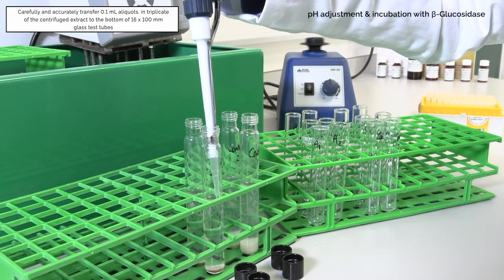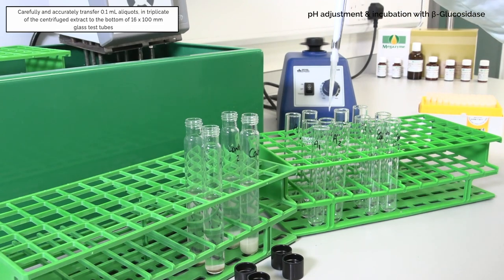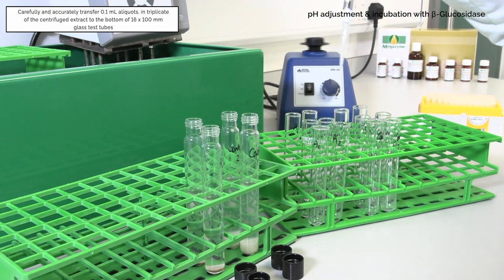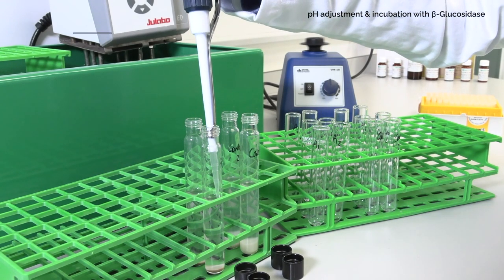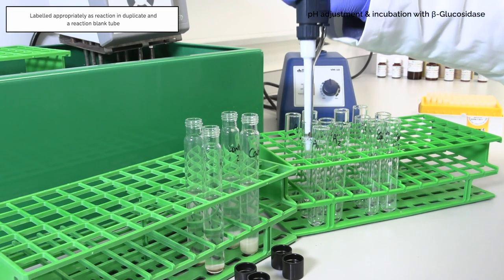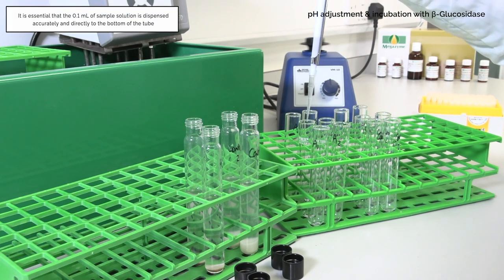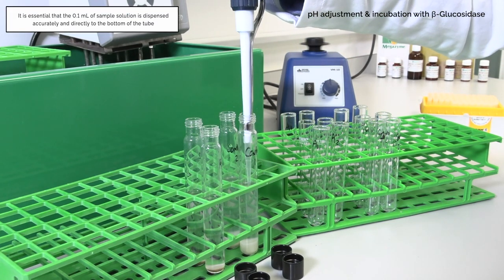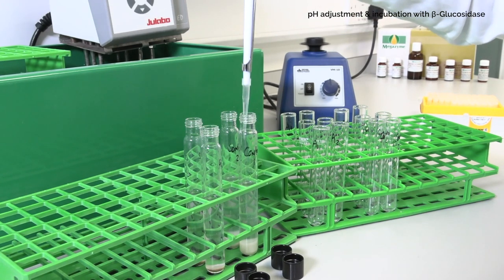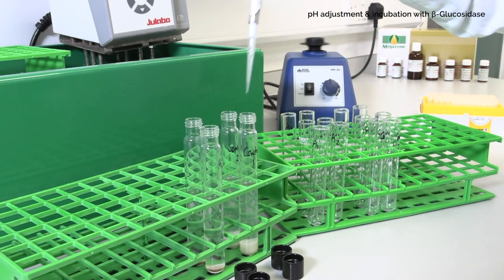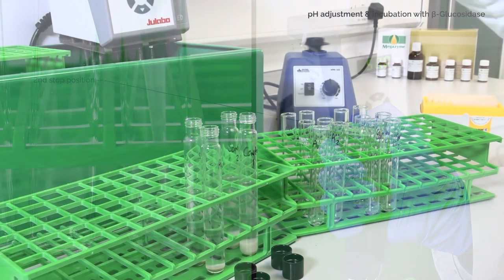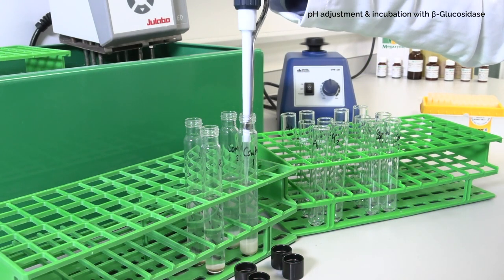Carefully and accurately transfer 0.1 milliliter aliquots in triplicate of the centrifuged extract to the bottom of labeled 16 by 100 millimeter glass test tubes, labeled appropriately as the reaction in duplicate and a reaction blank tube. It is essential that the 0.1 milliliter of sample solution is dispensed accurately and directly to the bottom of the tube. When using positive displacement pipettes, steadily push the dispenser plunger to the first stop position, then push to the second position to ensure all solution is completely dispensed.